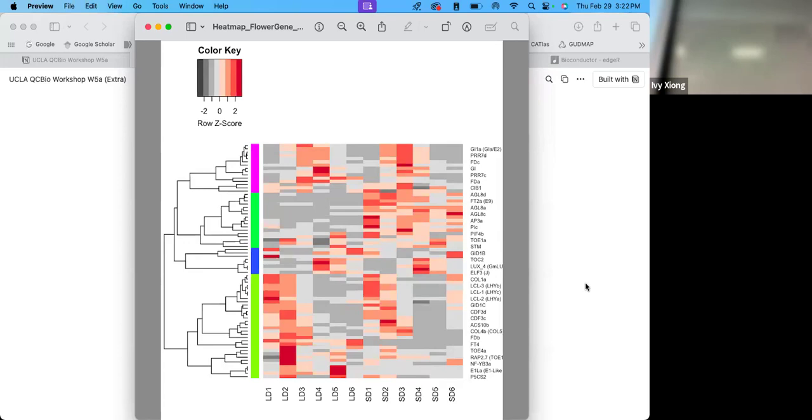Oh, yeah, so we saw this earlier. Yeah, I tried to do that. No, it's the library. So now we're trying the analysis. No, it didn't, it just started, we did the last thing. Yeah, it just did that. So you can continue.